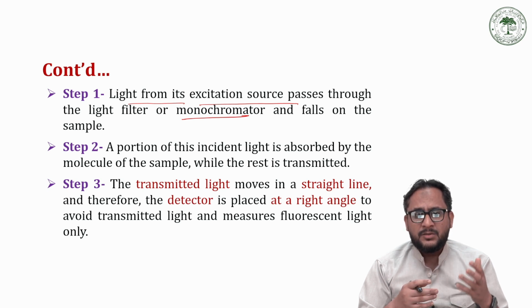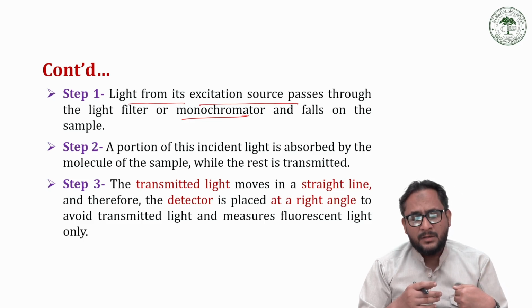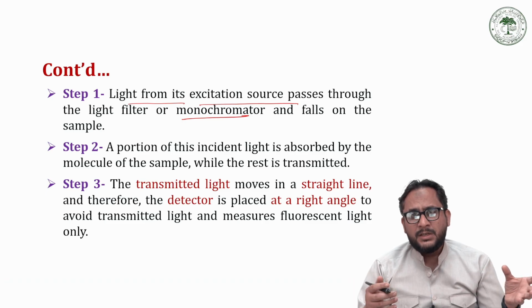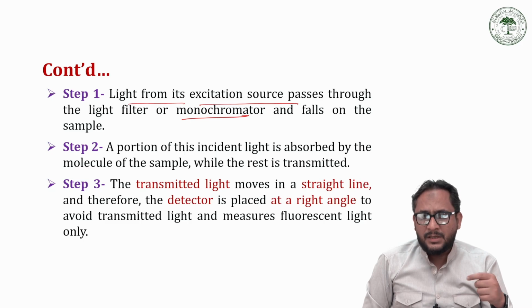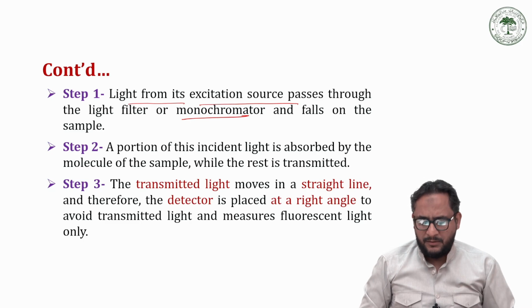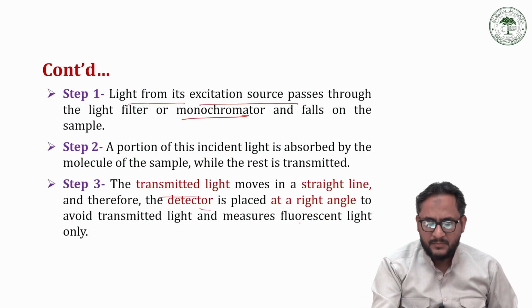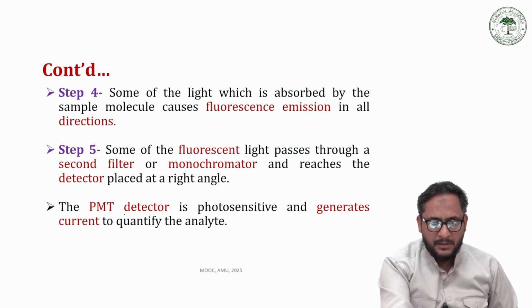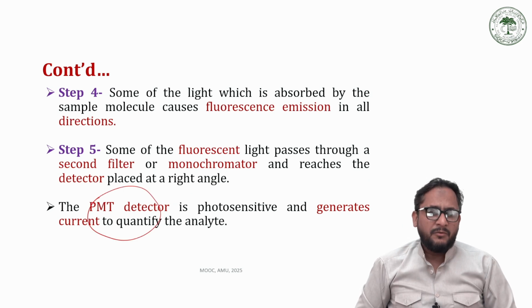It passes through the entrance slit. Again there is a focus mirror which reflects light to the grating, which disperses light into individual narrow wavelengths. Then these narrowed down wavelengths are again reflected by a mirror and focused through the exit slit, finally falling on the photomultiplier tube, and a signal is obtained which is represented in the form of a peak on the output device.